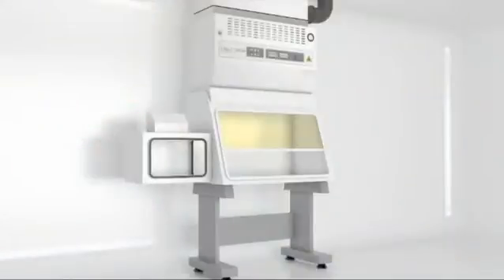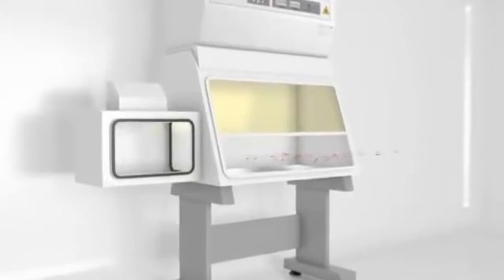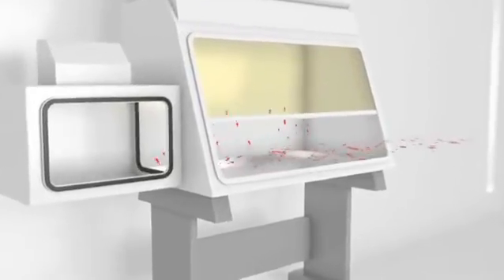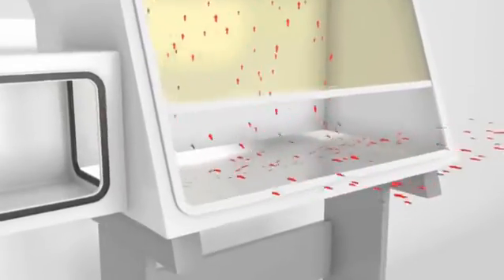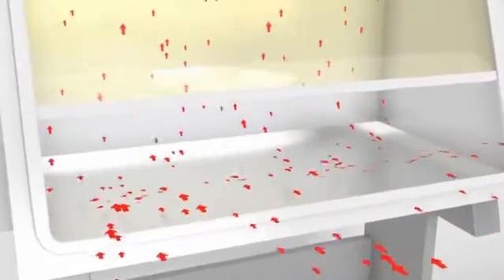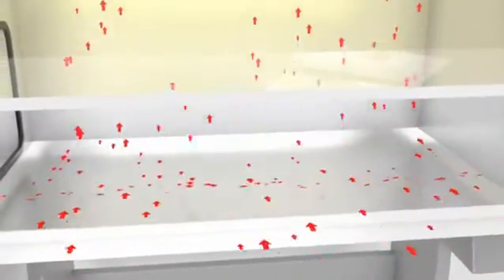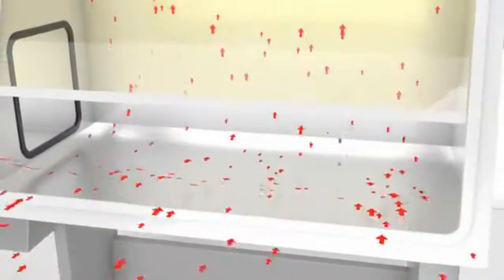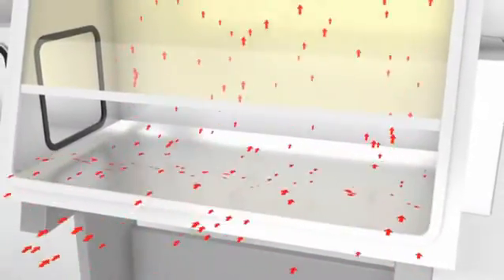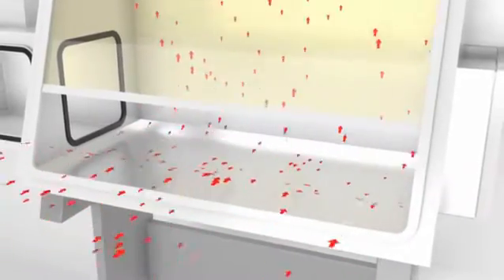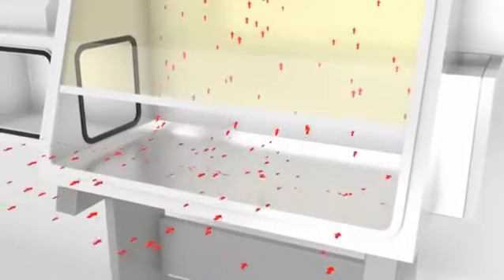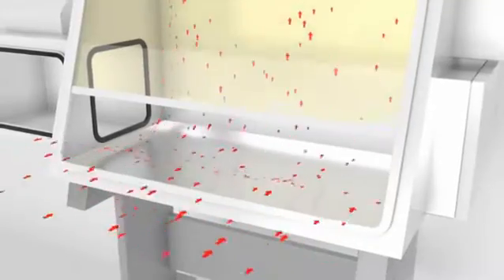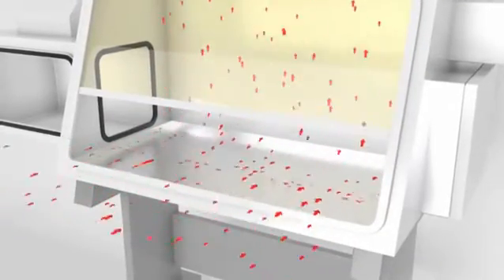In a class 1 biological safety cabinet, room air is drawn in through the front opening at a velocity of between 0.7 metres per second and 1 metre per second. It passes over the work surface and is discharged from the cabinet through the exhaust duct. This directional flow of air ensures that any aerosol particles present on or around the work surfaces are taken away from the operator and into the exhaust duct.